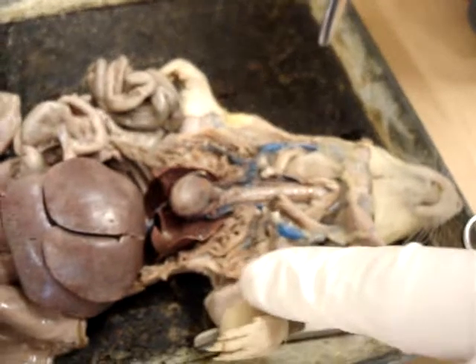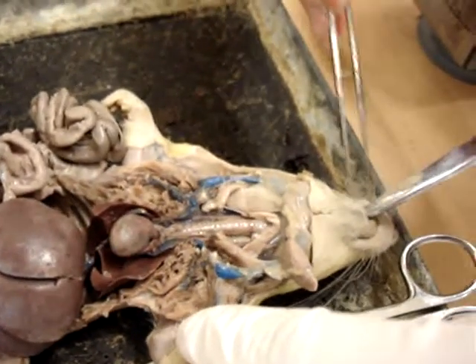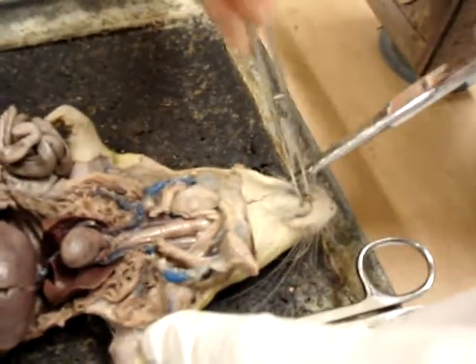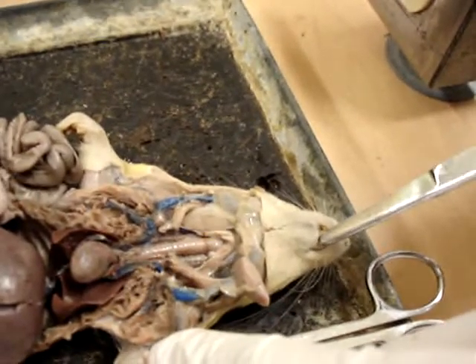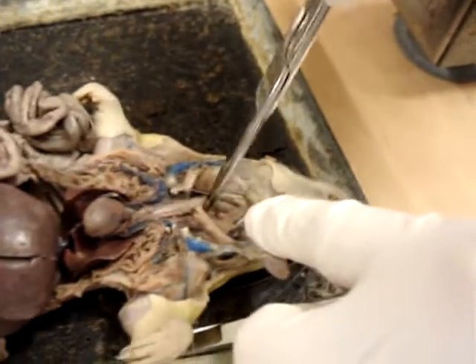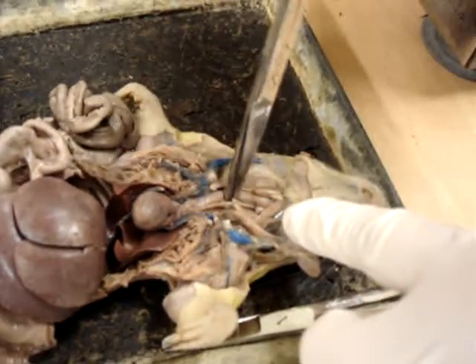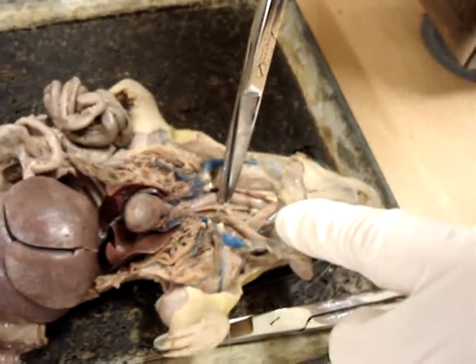Moving on to the digestive system. We've got the mouth — that's the mouth here. The tongue would be inside the mouth; that's the tongue right there. The pharynx, as I just mentioned, is right before the esophagus. The esophagus would be right behind the trachea — right behind the trachea you find the esophagus.